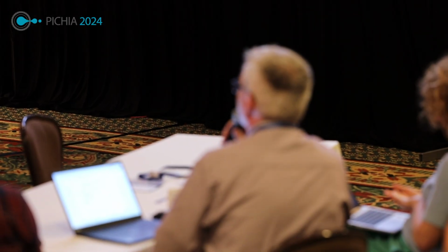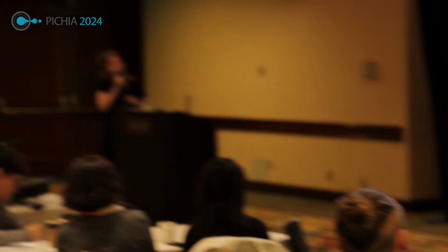Thank you for your nice talk. I just got a question. So how do you translate the oligo part to the protein part? That's not completely clear to me. First you generate your library on a DNA level, and then you clone it into the surface display vector that I was talking about in the beginning, and you transform that to your yeast cells, and then they will generate the proteins, so they will try to secrete the proteins.